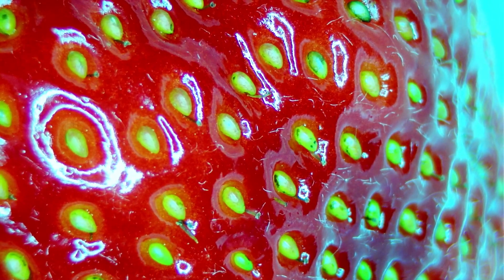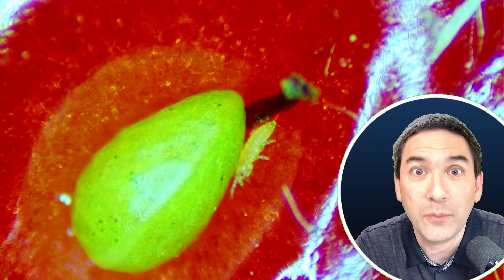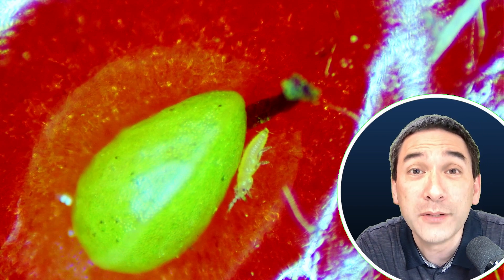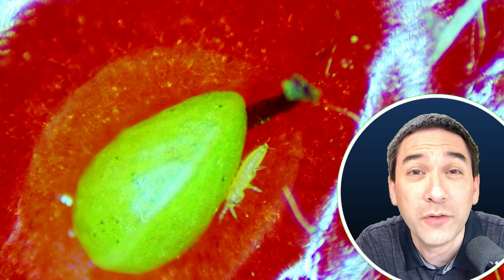Of course, you can see the seeds quite large. And then all of a sudden I saw some movement. Look at this — a little tiny insect trying to hide behind the seed of the strawberry. What in the world is that? I kept on checking the next strawberry and I found those little insects on pretty much every strawberry that I put under the microscope. I didn't even have to look very hard for them.